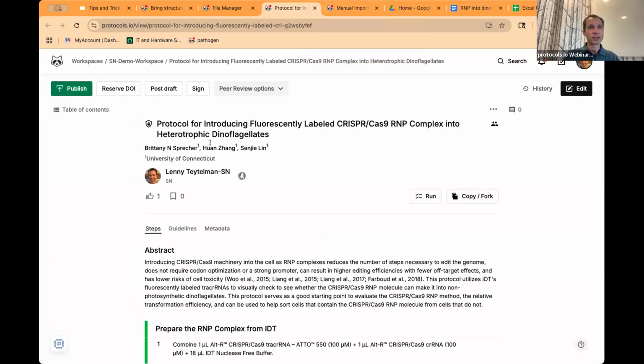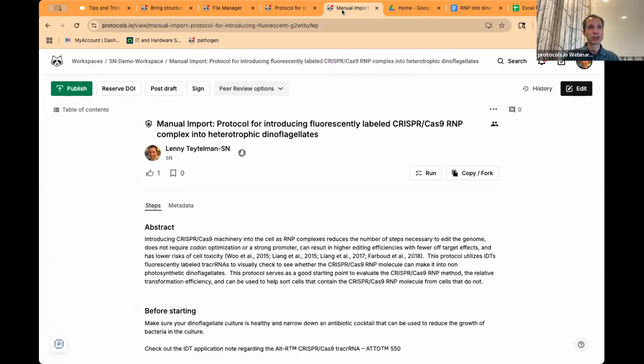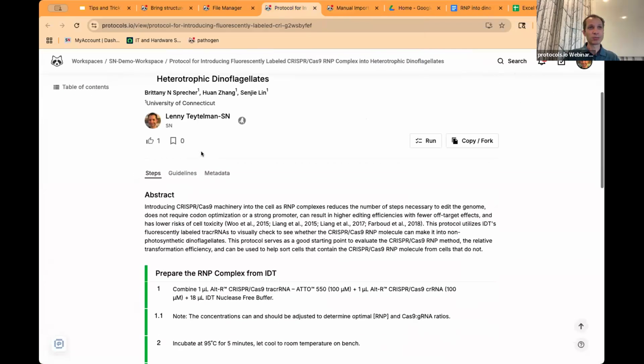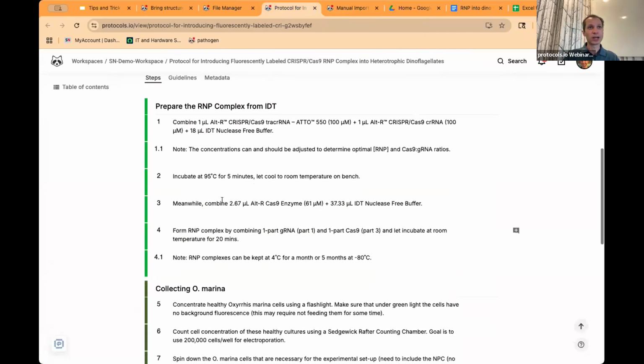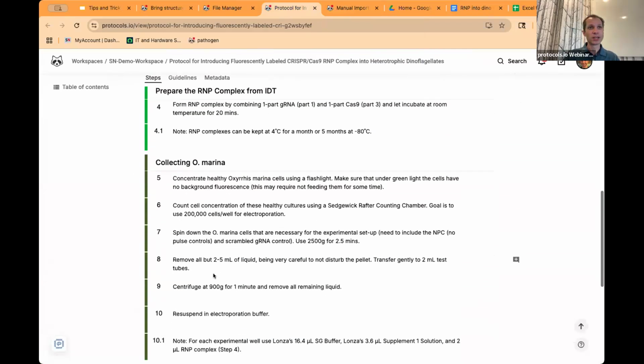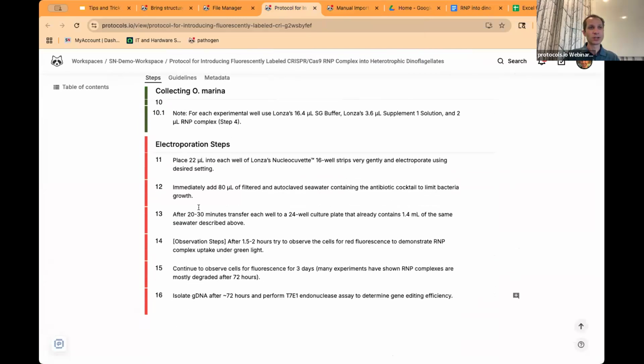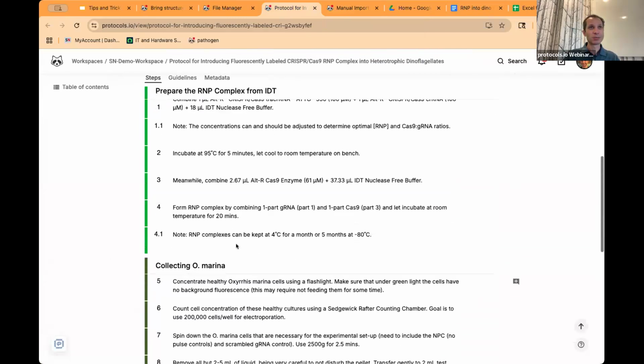First of all, you'll notice I forgot to put the authors in. The automatic import converter did that really well. I don't have the authors here. If you have many authors and affiliations, it will recognize them, put them in correctly. We have the abstract, and then we have section 1, section 2, and section 3. So these are our 16 steps.